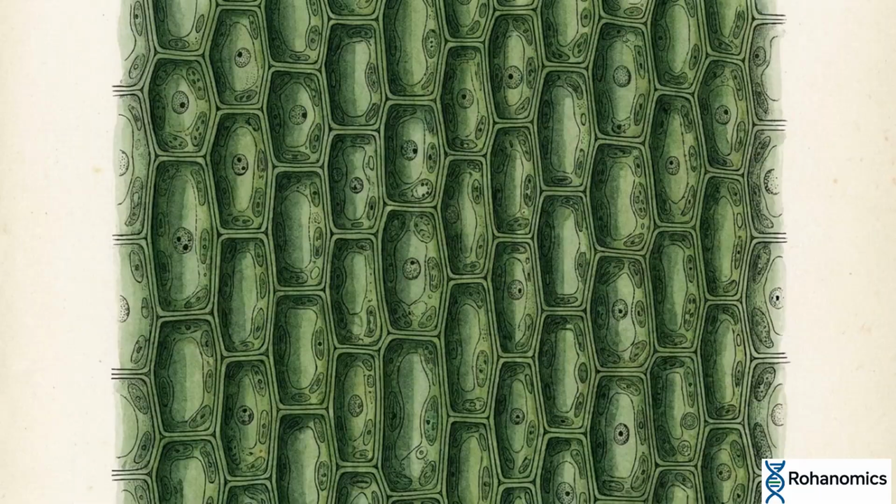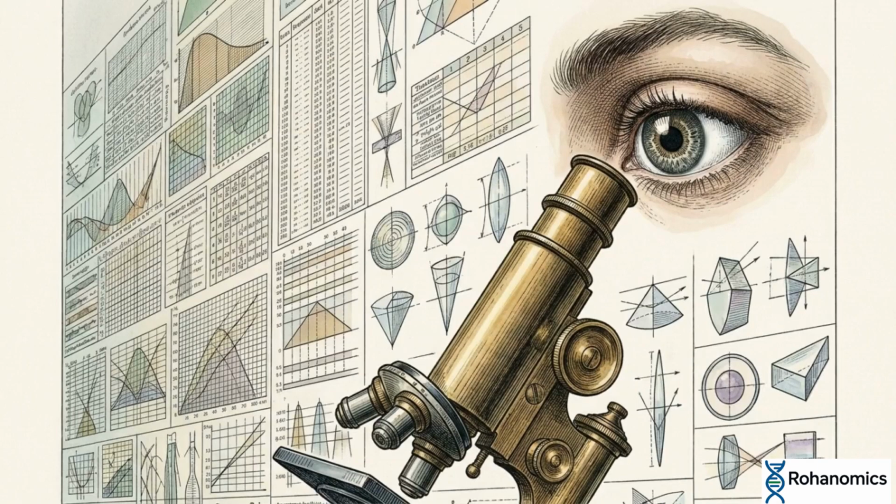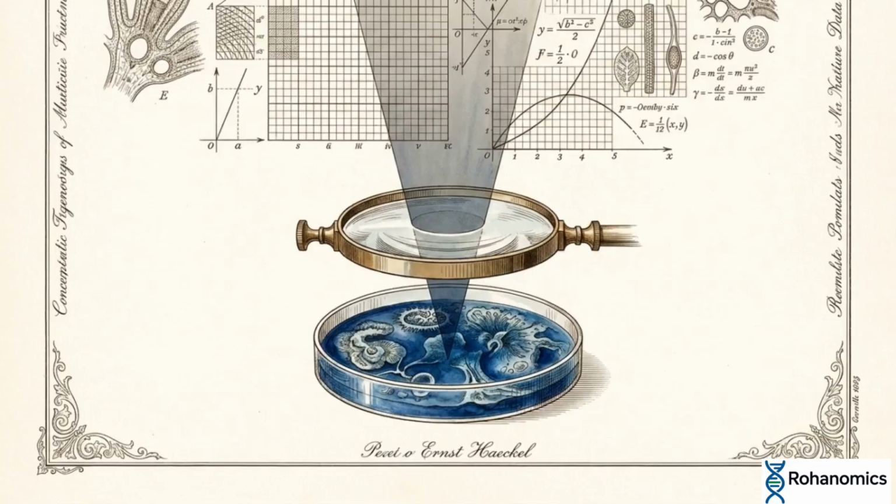And if you are measuring complex, differentiated tissues, you bypass the macrostructure entirely, extracting and quantifying the foundational nucleic acids or photosynthetic pigments. Bioengineering scales up by moving past the limitations of the human eye. We achieve precision by selecting the exact physical or chemical lens necessary to make the biological system measurable.